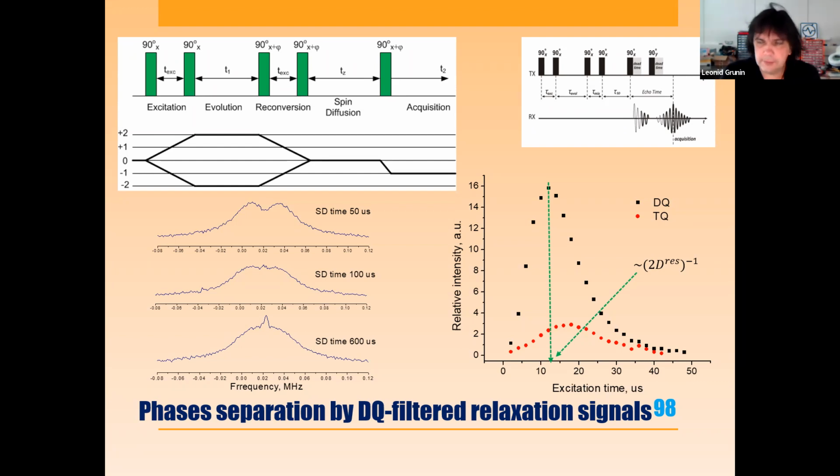It depends on the dead time, and on that time together with the pulse. For our classic system, we have a dead time of 7 to 10 microseconds, and the pulse is around 3 microseconds, so the sum is 12 microseconds. In principle, you can do lots of stuff on any rigid things. Even 20 microseconds altogether is not a big problem.